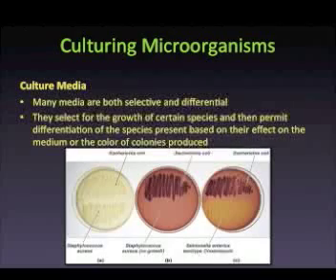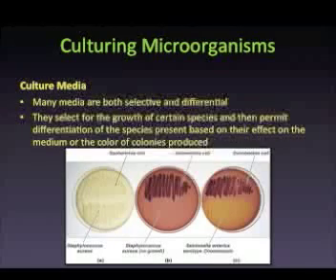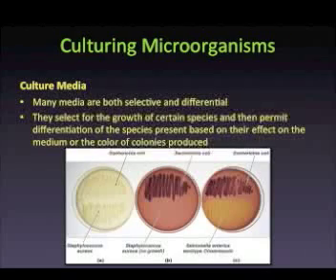In clinical microbiology, selective and differential media are very important in aiding in the identification of pathogens that cause infections in areas of the body like the respiratory and digestive tracts, where microorganisms normally reside as part of the normal flora. Specimens from such infections contain the pathogen along with bacteria of the normal flora. Selective and differential media aid in the isolation and identification of a pathogen.